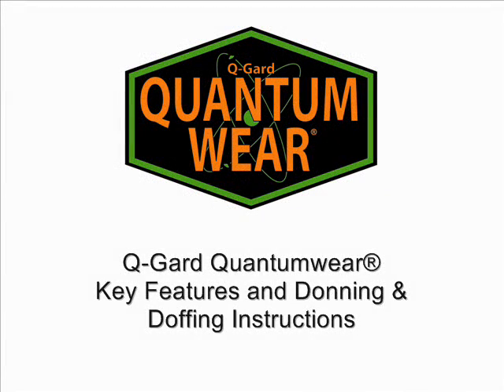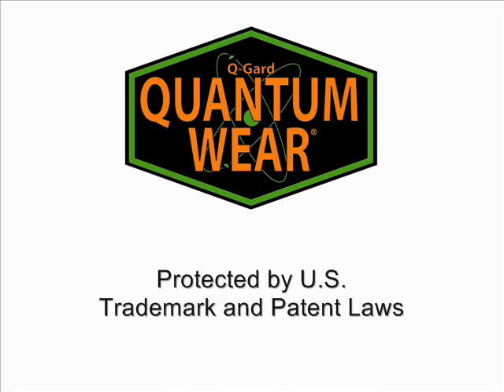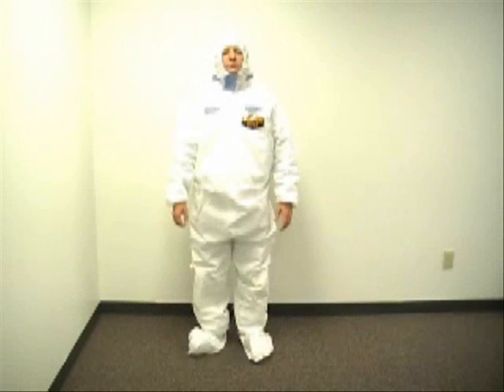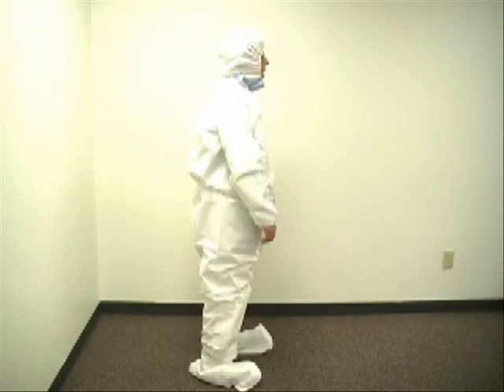In this video, we'll be going over the key features of the new Q-Guard Quantum Wear Suit, as well as basic suit donning and doffing instructions. The Q-Guard Quantum Wear Suit was developed with the help of radiological end users and expert focus groups in the field of nuclear decommission at major weapons complexes to address the specific challenges the nuclear industry faces with respect to safety, comfort, and ease of use.